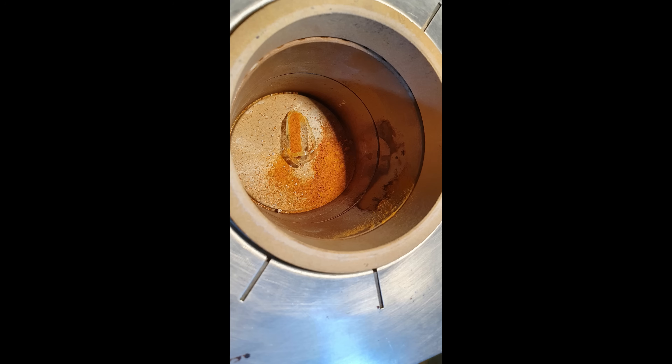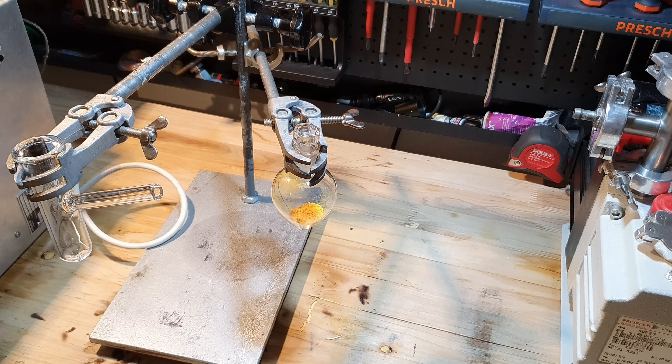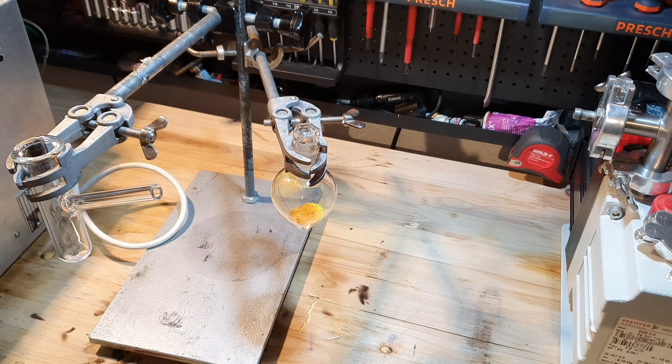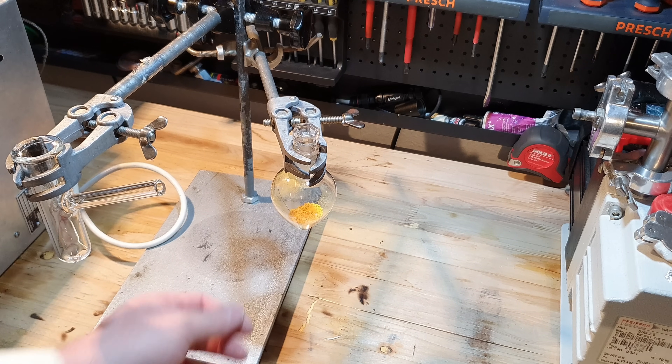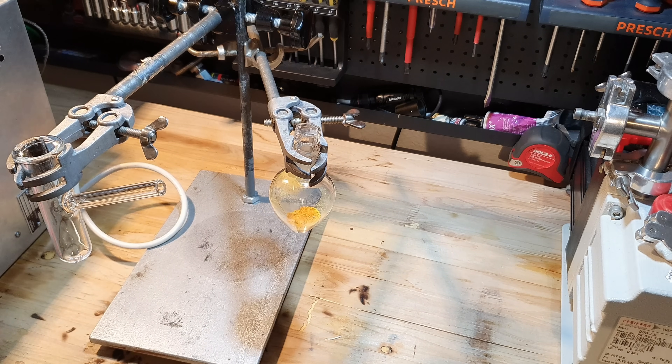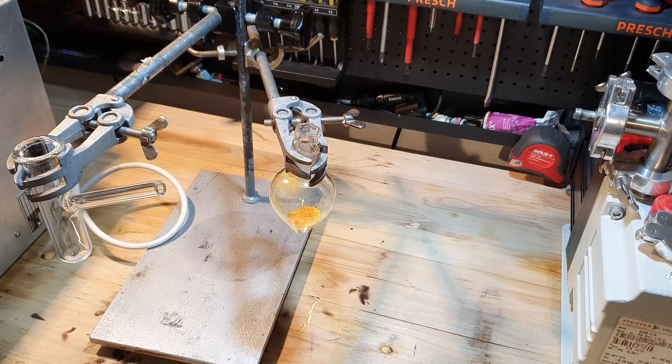Then after six days it happened — I screwed down the clamp too tightly and the reaction vessel cracked. I spilled all of the cesium superoxide and cesium oxide inside my oven. I was pretty pissed. After sitting on the couch for one hour straight and hating myself, I made a new reaction vessel. And I'm now going to transfer the product I've saved from the oven into the new reaction vessel and keep going.